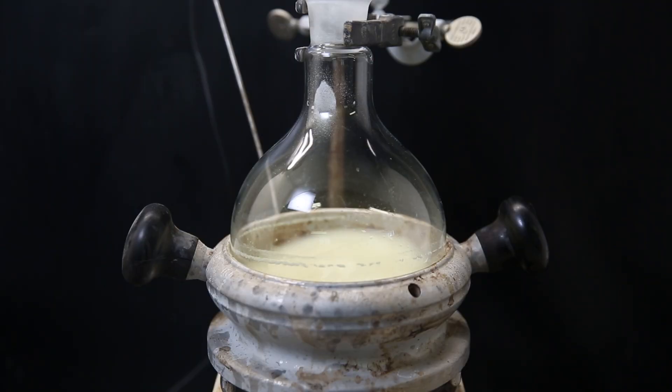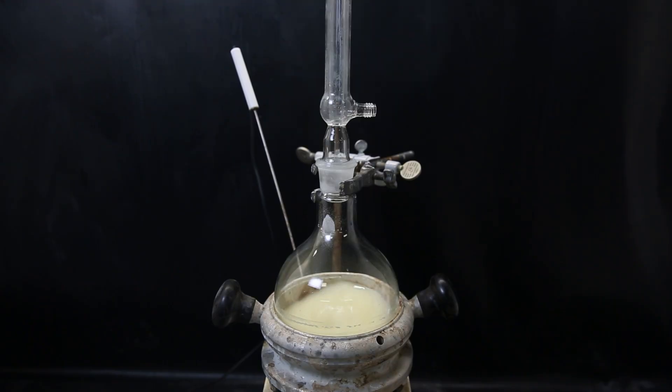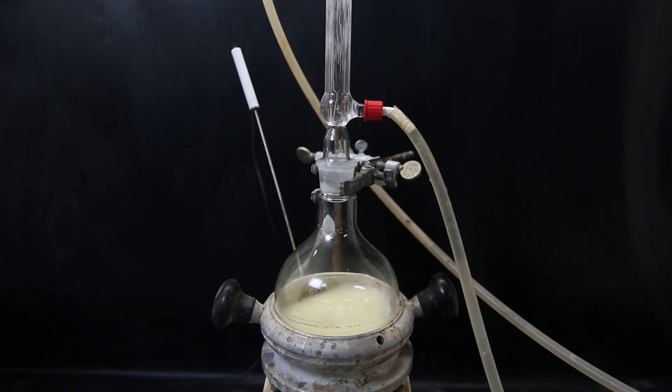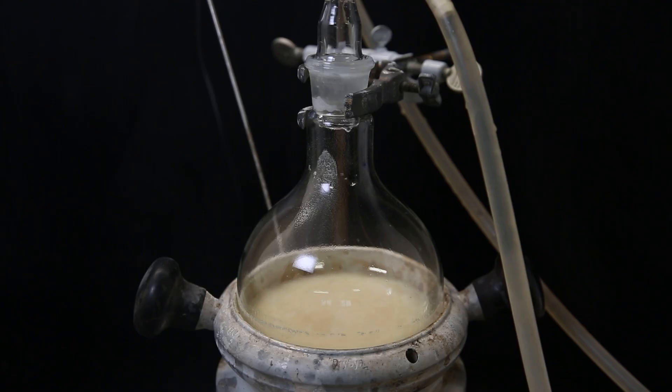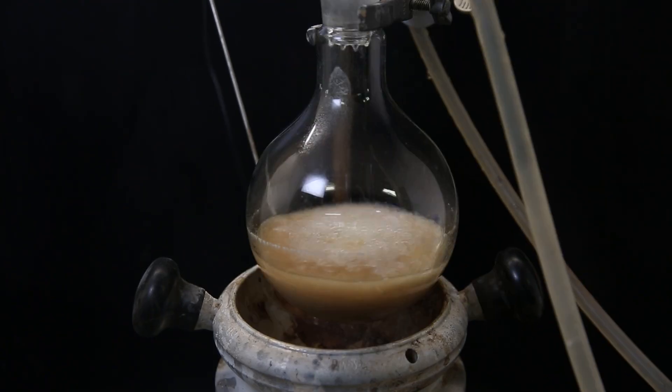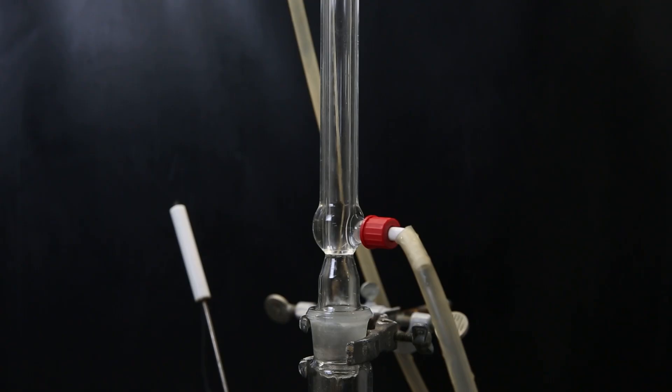And afterwards set the flask in a heating mantle. I attach a condenser and heat the mixture to 100°C. Over time the mixture gradually becomes darker and an exothermic reaction is taking place. It starts to boil vigorously and I have to take it off heat so that the condenser can contain it.